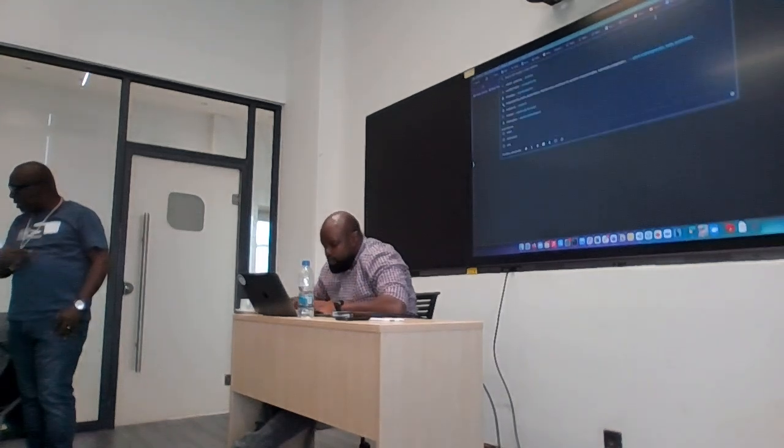Hey, Ella, you remember this one? Let me remind you, because you might have forgotten. Where is my file? Go for lunch.